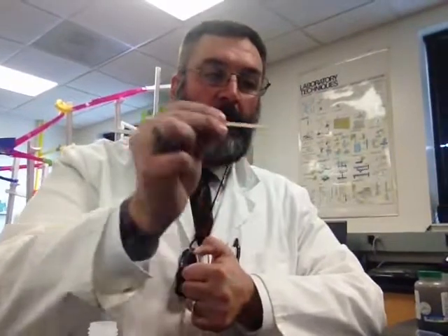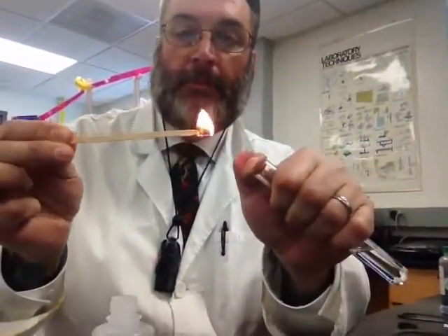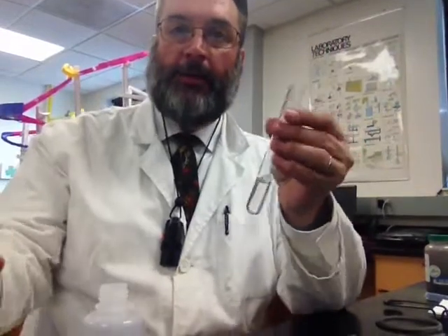So to test for hydrogen, all I need is a little bit of fire. Did you hear that? That little pop. That's an indicator that there's hydrogen present. Okay, hydrogen is very flammable, so it pops when it gets around fire. So there's your second reaction. Magnesium plus hydrochloric acid.